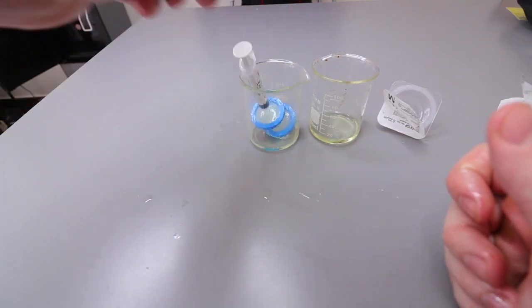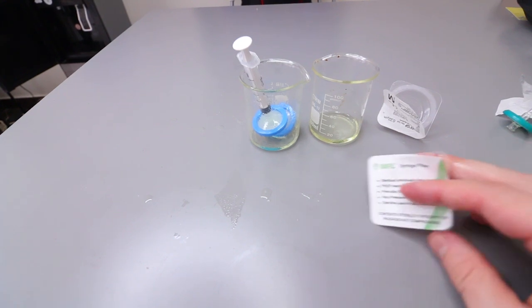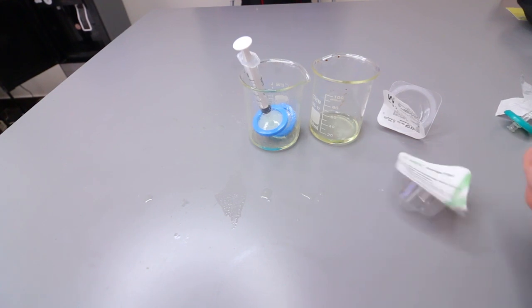So yeah that's why our filters are a little bit more expensive. If you are going to buy filters, if you don't want to buy them from us then you can get them on Amazon, but the price you'll pay for a decent filter is about our price if not a little bit more expensive. You can find cheaper ones like I've demonstrated today but yeah that's kind of the problem.